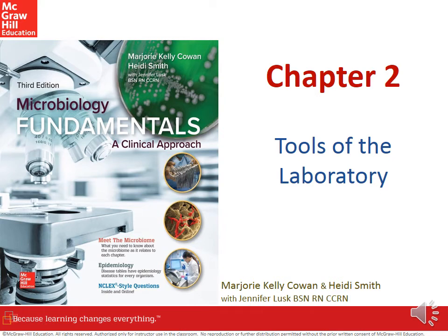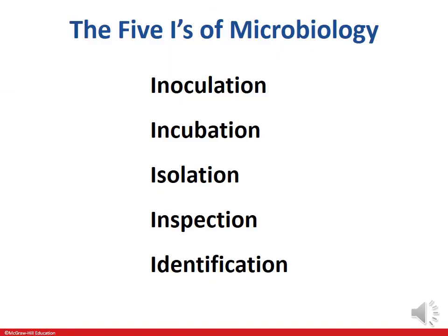So now that we've talked about bacteria, we're going to talk about how we can work with bacteria in the microbiology lab. To work with microorganisms generally requires these basic steps: inoculation, incubation, isolation, inspection, and identification. Let's talk about what's involved in each of these.